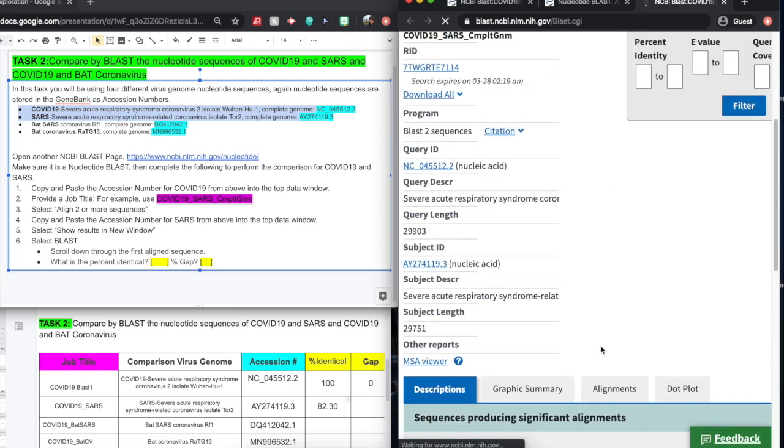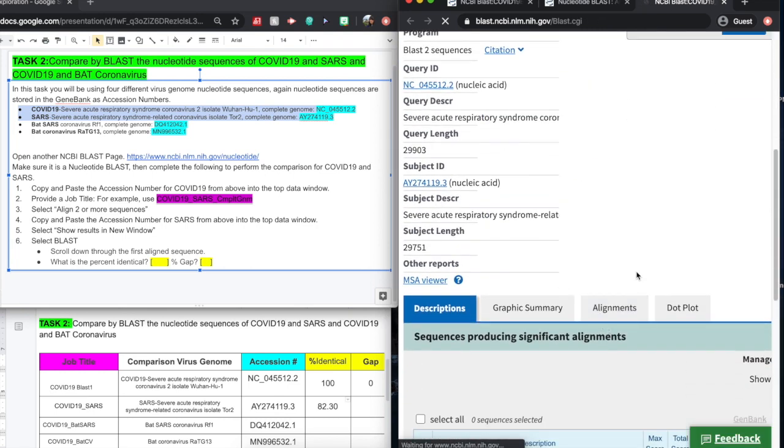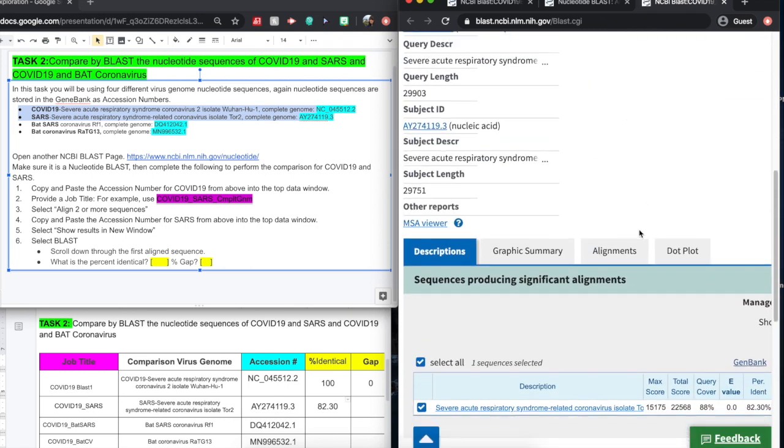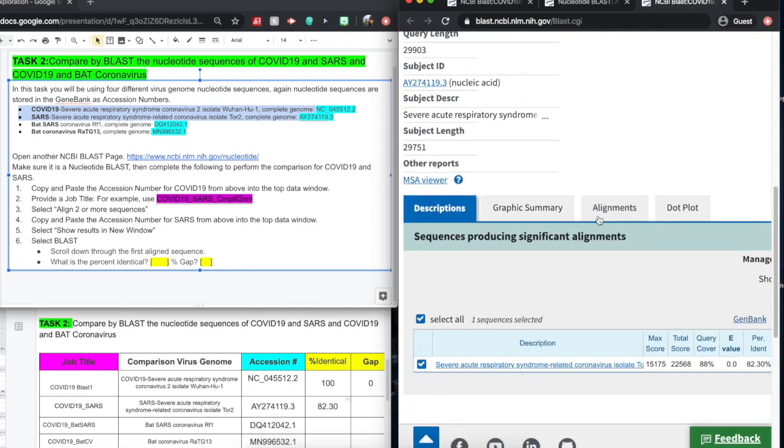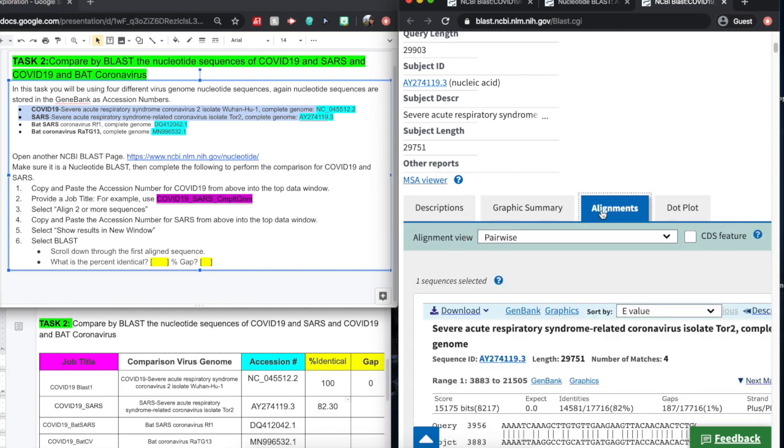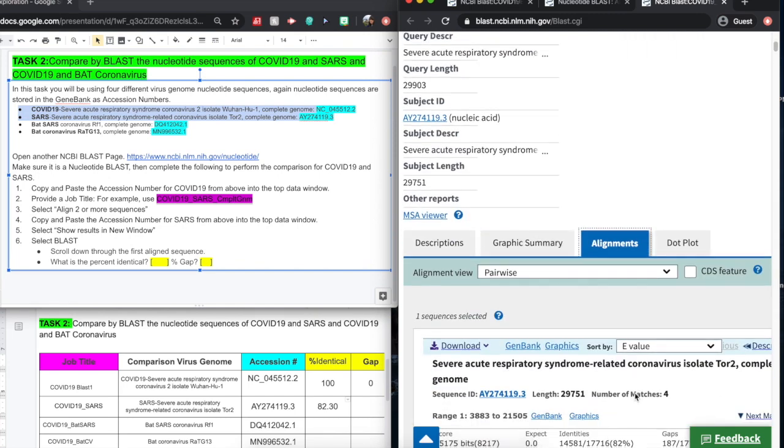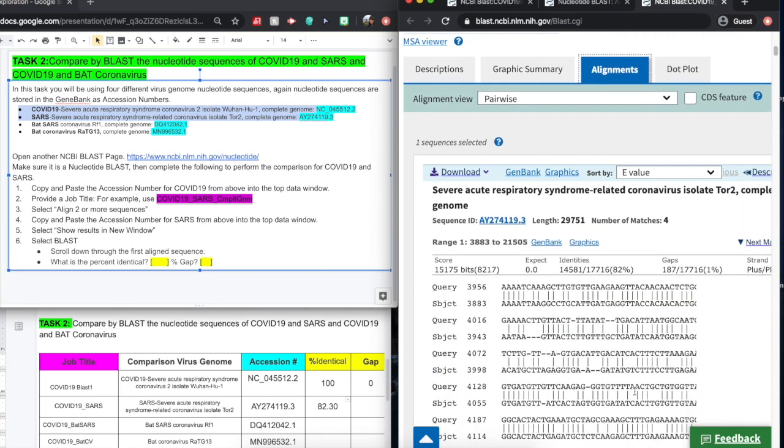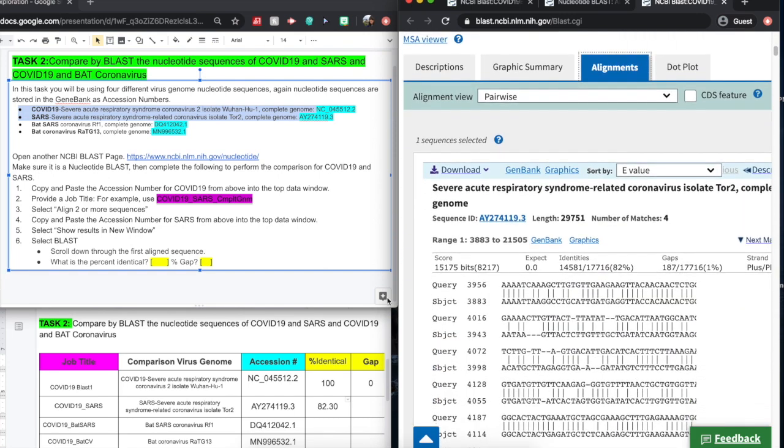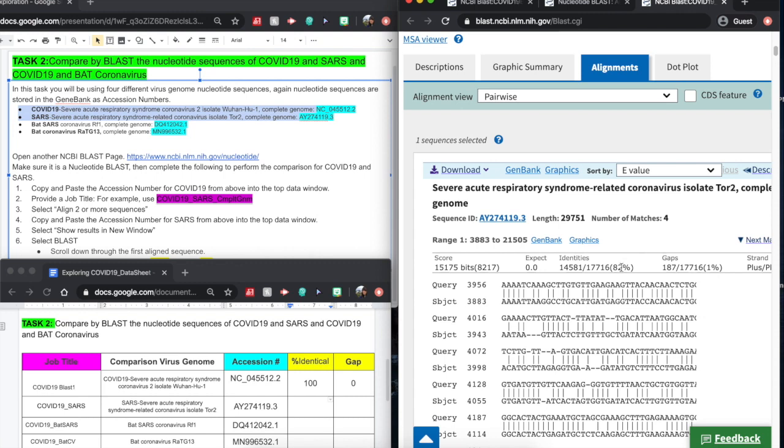And it looks like it's done. Now, we want to be able to see the alignment. Here we go. You can see our nucleotide sequence. So this is our original and our SARS. You're going to gather your identity percentages and your gap percentage, and you'll place that right into our data collection sheet.